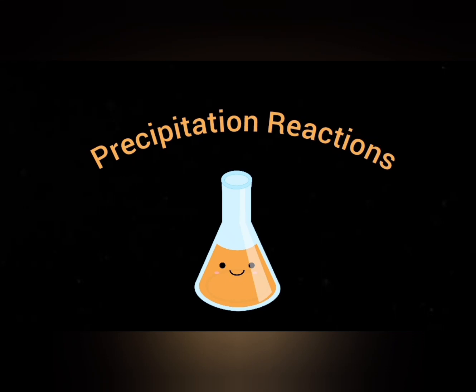Hello and welcome to the Module 4 Post-Lab Reflection, where this week we created aqueous solutions of calcium chloride and sodium carbonate in order to make a precipitation reaction. Within this lab, we used filtration methods to get a product from the reaction of calcium carbonate.